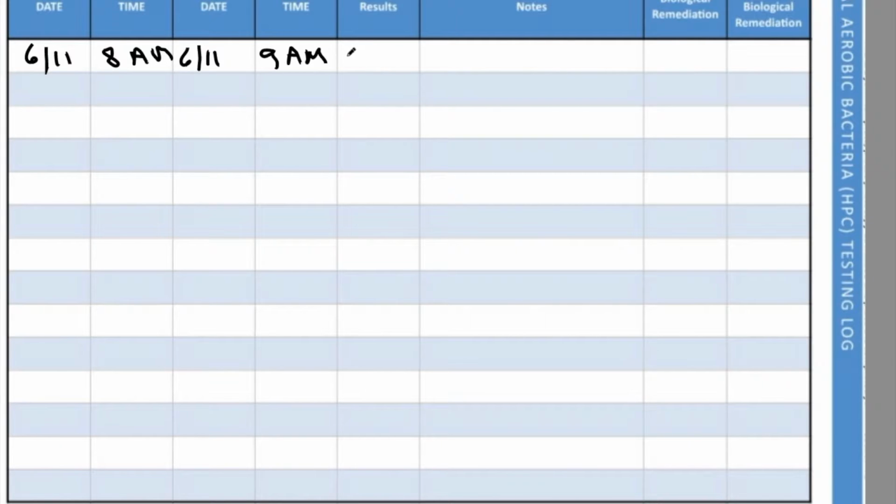So if you have less than 10,000, that would usually be pretty routine. You can just write in here less than, that symbol represents less than 10,000. Right? So you can write it in there like that. That's the same thing as the 4 zeros that you have there. Okay? So you can write it in as 10,000, or you can write it in as 10 to the 4th.